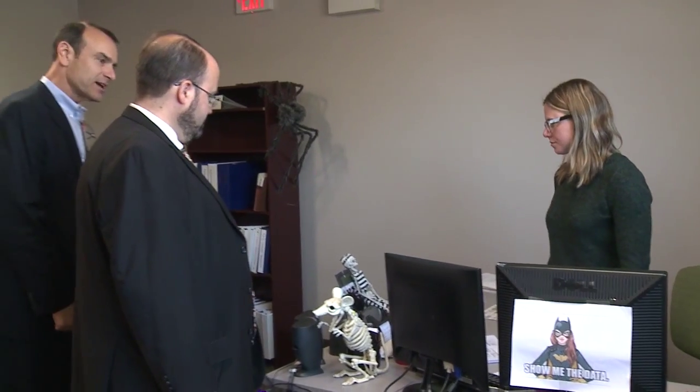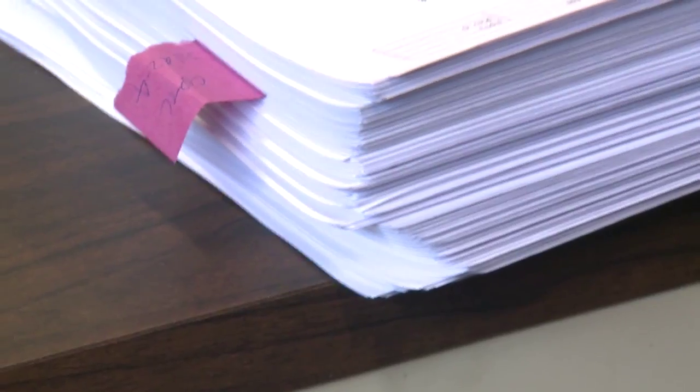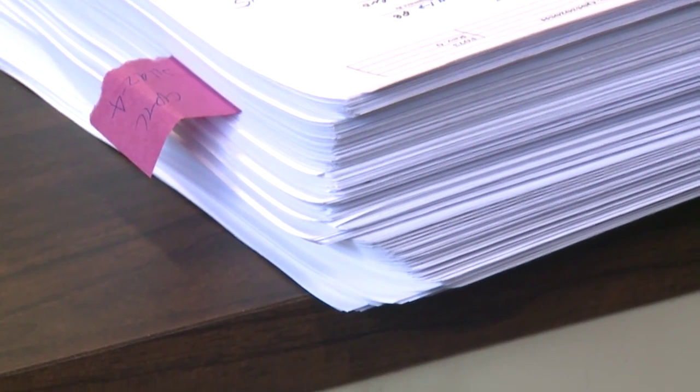It comes out, believe it or not, in reams of paper, and they read through it. Do they translate this to layman's terms, or how do you explain the data? We just take the data and put it onto a Word document, and that gets sent out to the client as an analytical lab report.